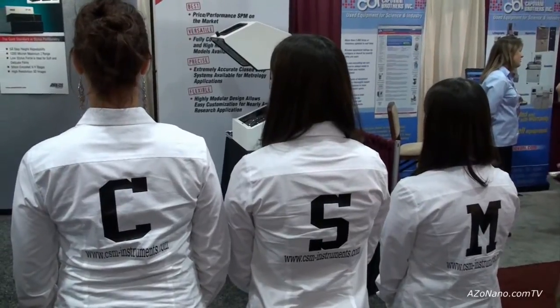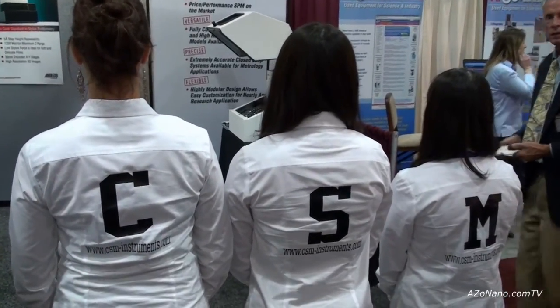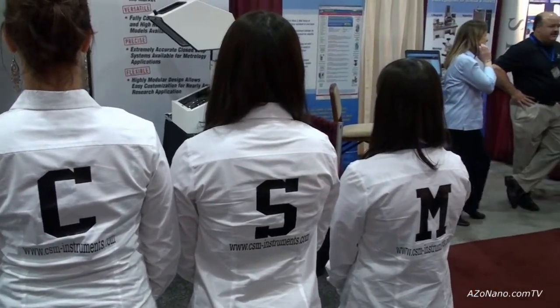This is Cameron Chai from azonano.com and I'm speaking to Nick Randall from CSM who's going to show us their Revitest scratch tester. Thank you, Cameron.